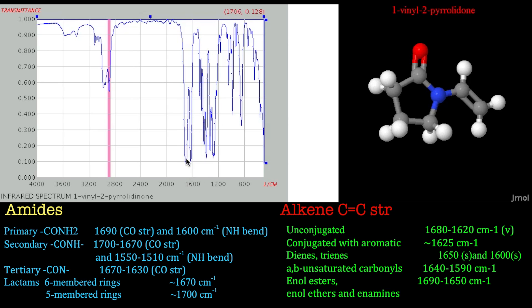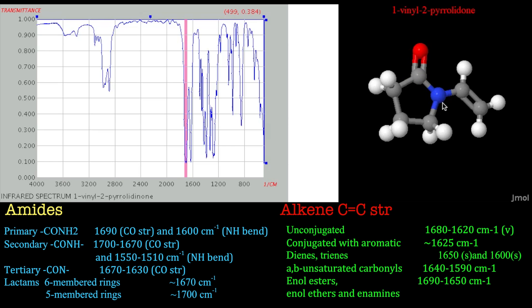We've got this big peak here. This should be pretty easy to spot, because this is your carbonyl, and everyone should be used to carbonyls now. It looks like it's a little bit low, and that's simply because it's an amide — it's got nitrogen connected to the carbon.